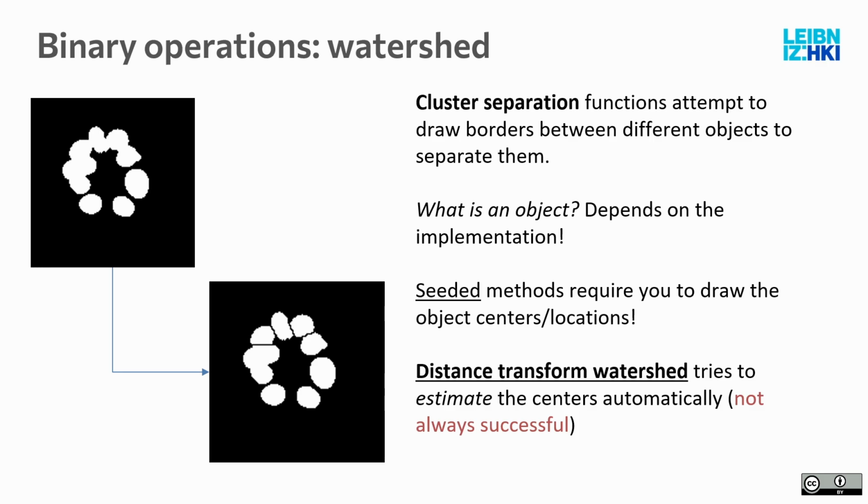It worked somewhat. It worked fine for these, but then here I would see 3 cells that are still clustered together. So it's not always successful, and the only thing that solves it very consistently, I think, is AI-based methods.